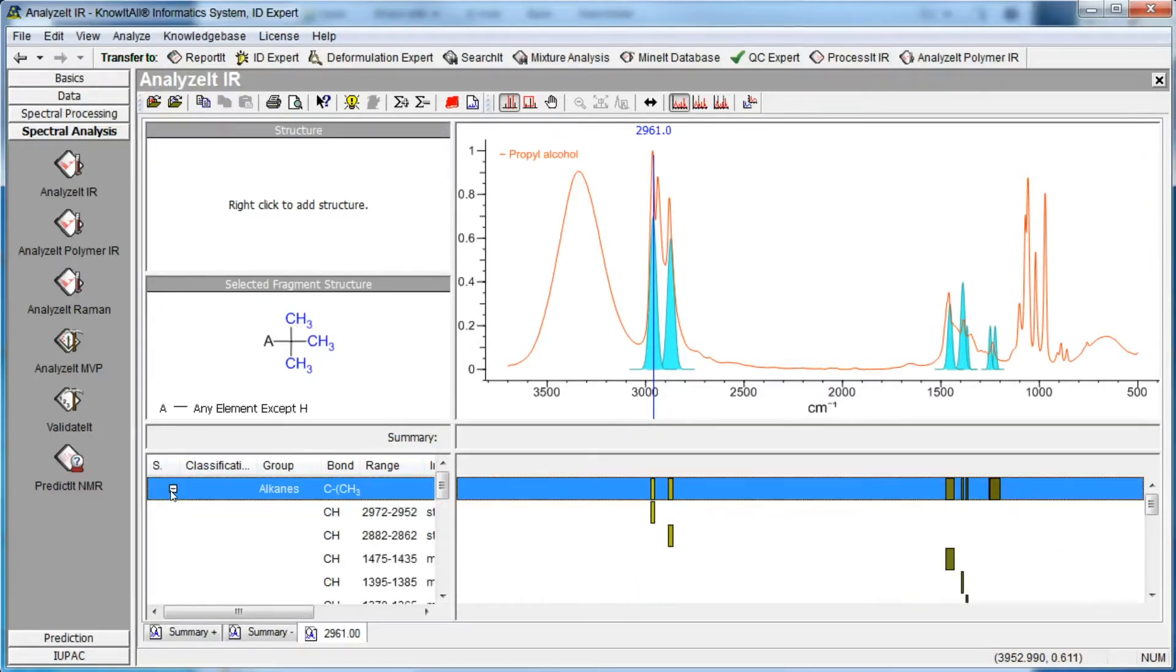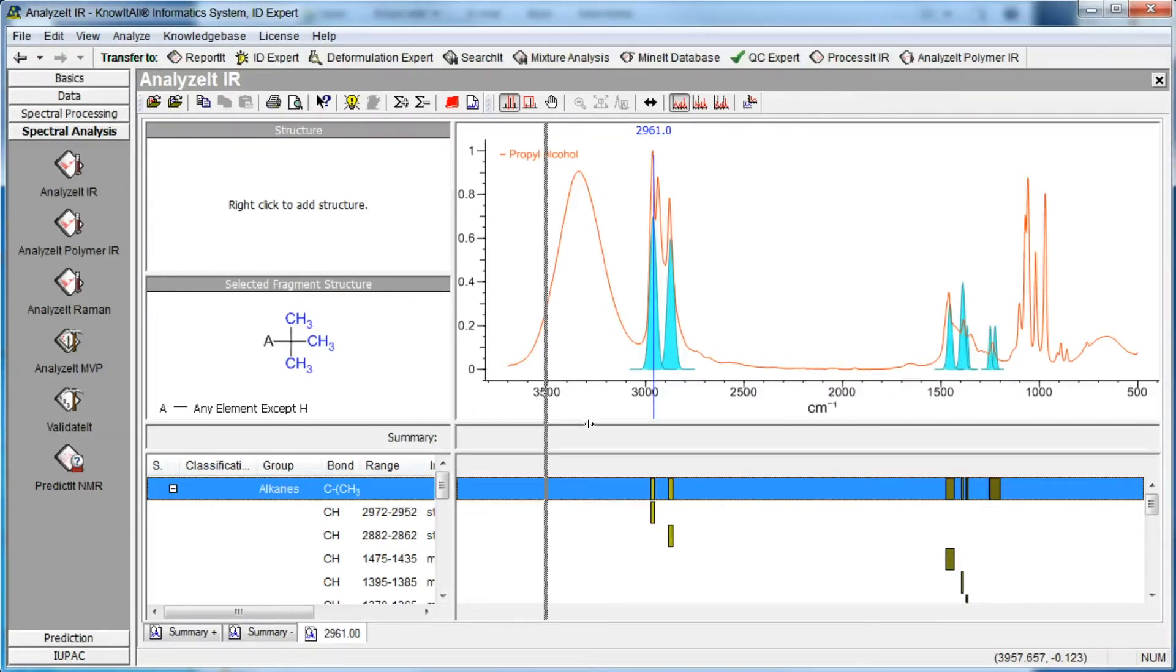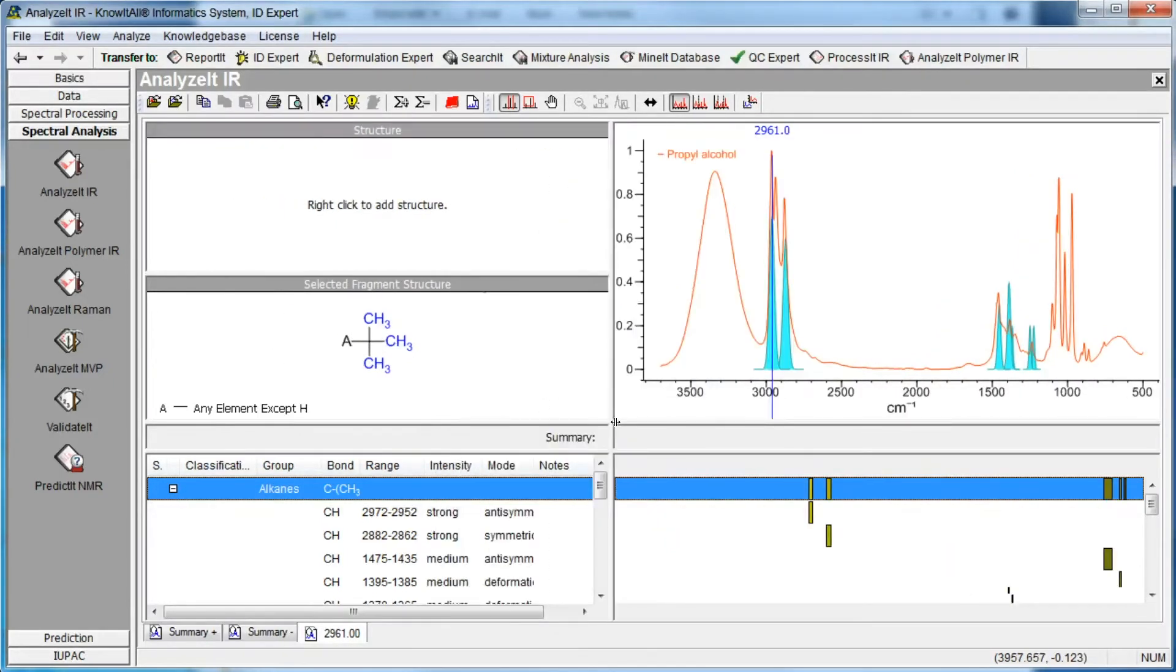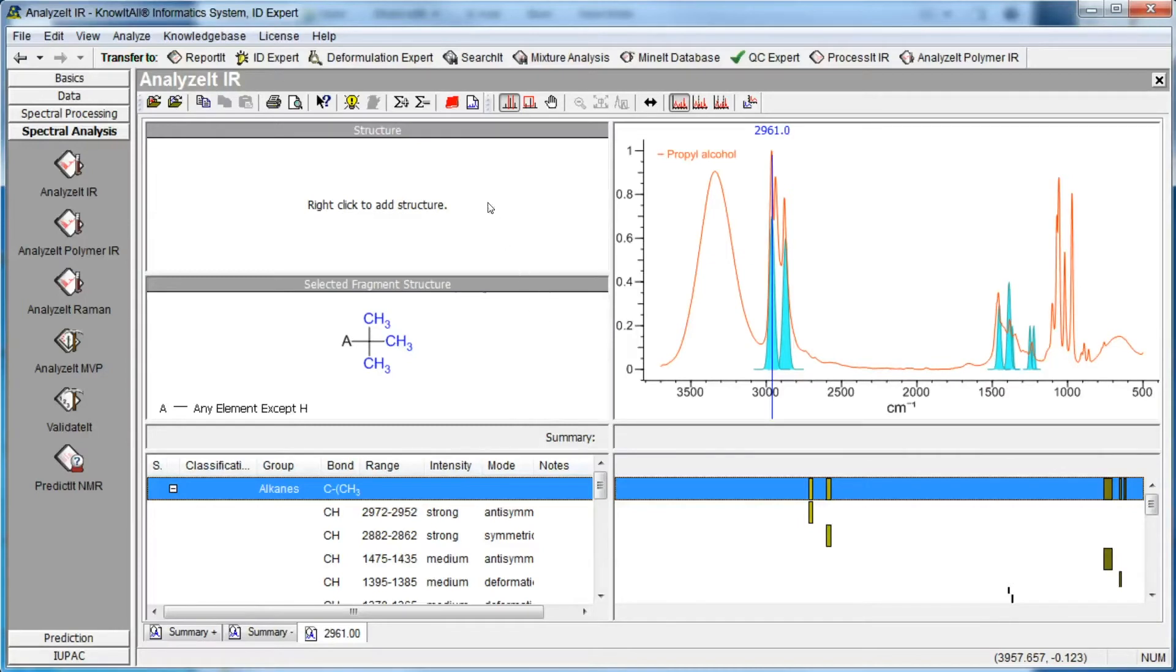You can resize the functional group data pane to see additional information. For more information about the selected chemical class or functional group, click the Open Book Toolbar button.